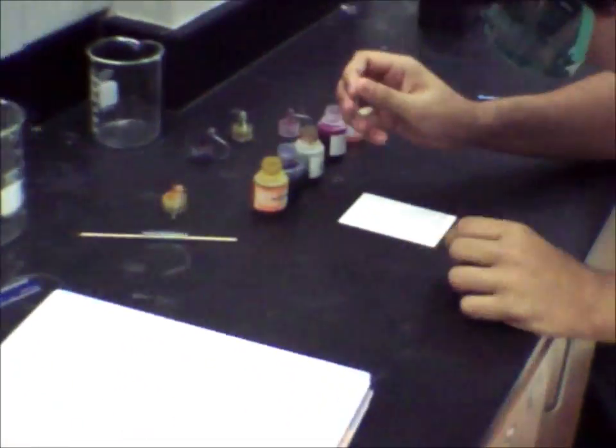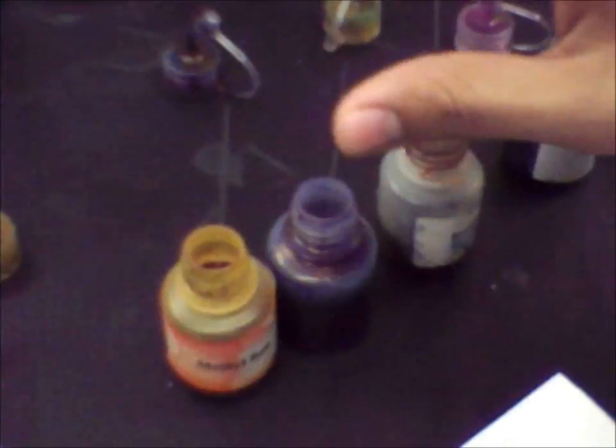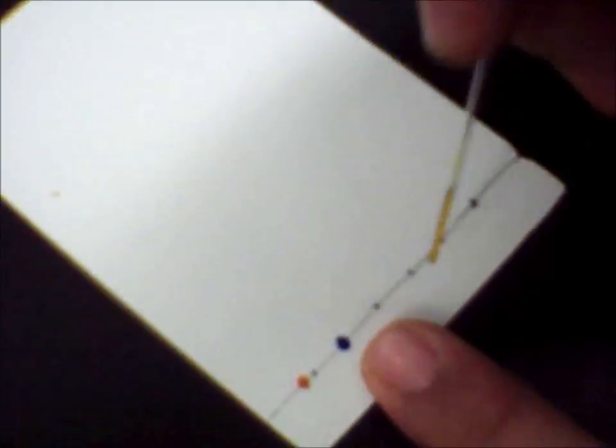Spot the chromatography plate with the dye on equidistant locations, exactly 1 cm from the bottom of the plate, using a small dropper. You don't want your spots to be too big.